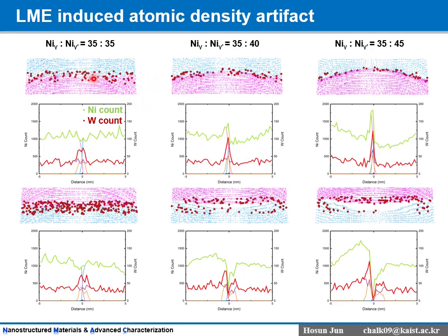When we look at the upper interface first, tungsten atoms are compressed toward the interface as the field difference gets larger. This can also be seen in the density curve of the proxygram. The density of nickel is constant when the field of the phases were the same, but a density peak at the interface shows up when the field difference gets larger because of the compression at the interface.